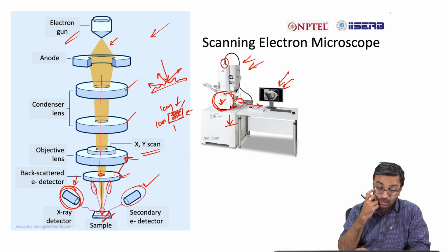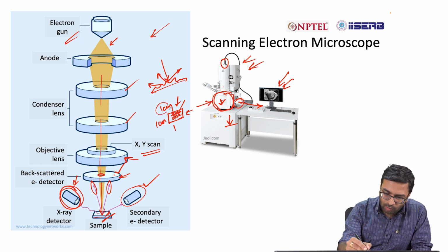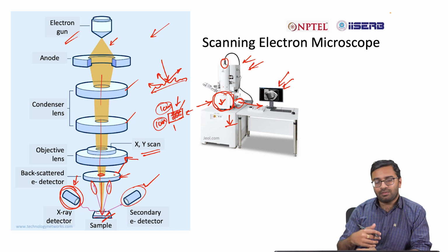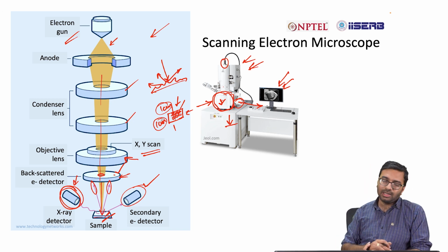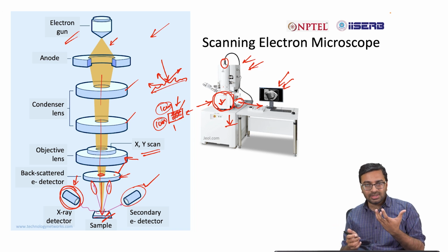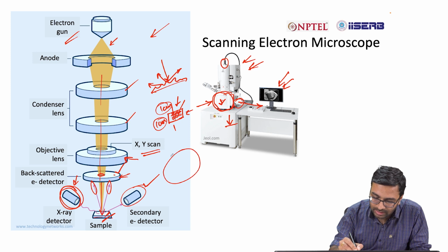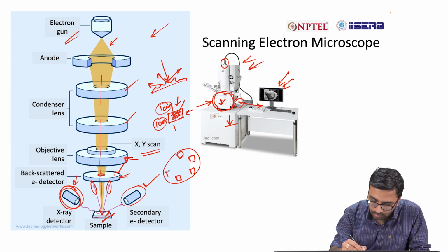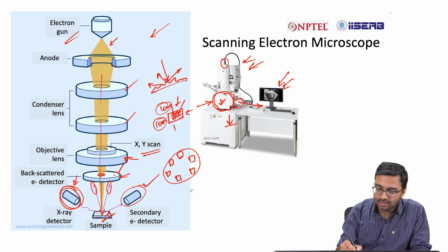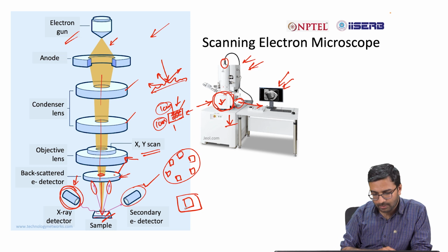Okay. So then you can insert the sample inside this vacuum chamber. The 1 centimeter by 1 centimeter is a kind of representative figure. It can be 2 centimeter by 2 centimeter, but it can't be very large. It depends on the sample holder also. Sometimes the sample holder allows, for example, it's like a disk, it allows say 5-6 different samples, and there are sample holders which only allow one sample on top of it, right.